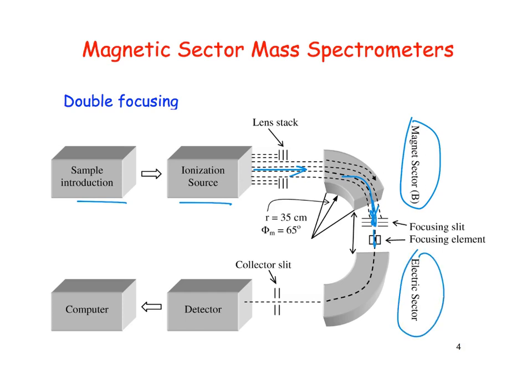It just has a voltage across here that can also cause the ions to curve. So we do it a second time, it goes through a second collection slit, and then gets detected. Because we're refocusing in the middle and doing this a second time, this creates a very high resolution instrument. So this is one of the instruments that they use for high resolution.